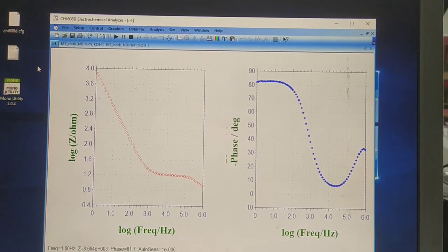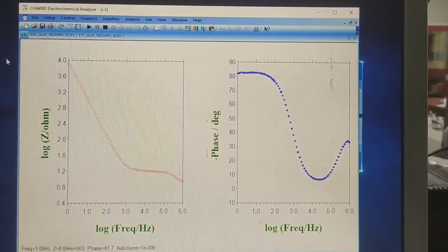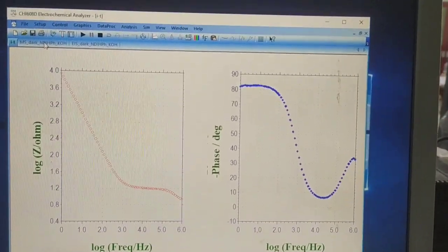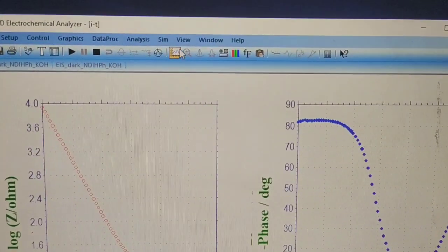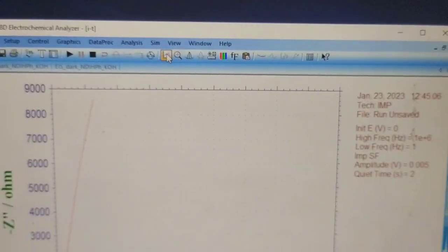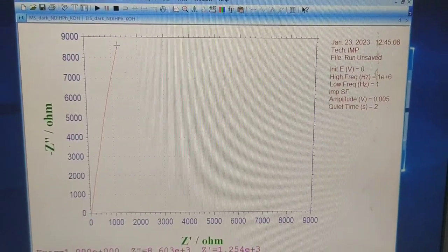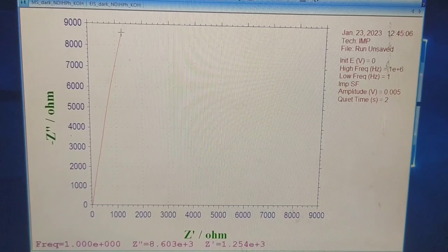Now the EIS has been recorded. To check the graph of EIS, let's click on the graph menu and you will see the EIS graph.